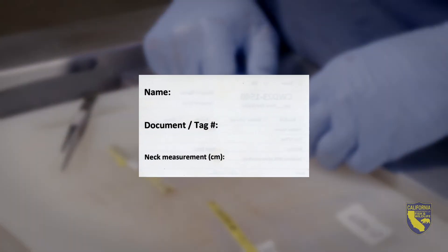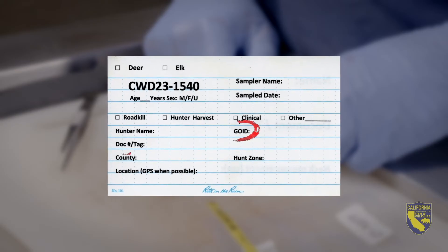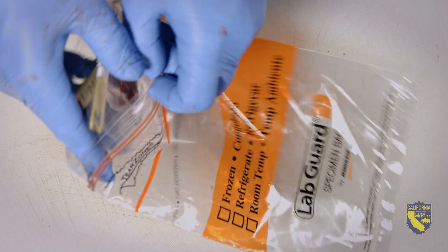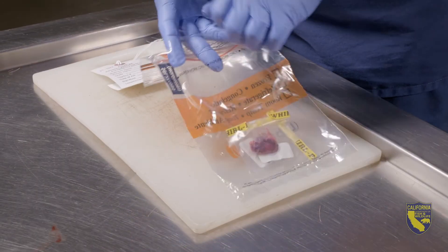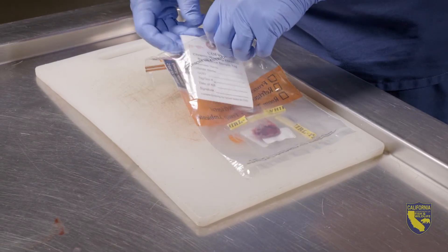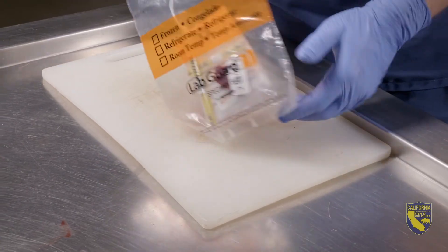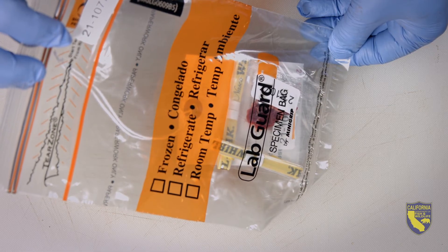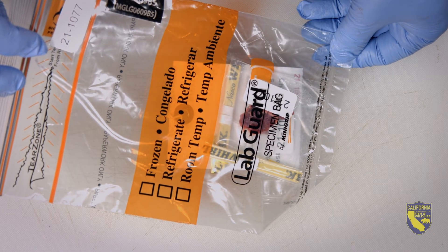Next, don't forget to fill out both sides of the data card. You'll need to know your GoID and tag number, both of which can be found on your hunting tag. Finally, place the sample bags into the resealable portion of the specimen bag and secure it. Insert the completed data card into the outside pocket of the specimen bag.